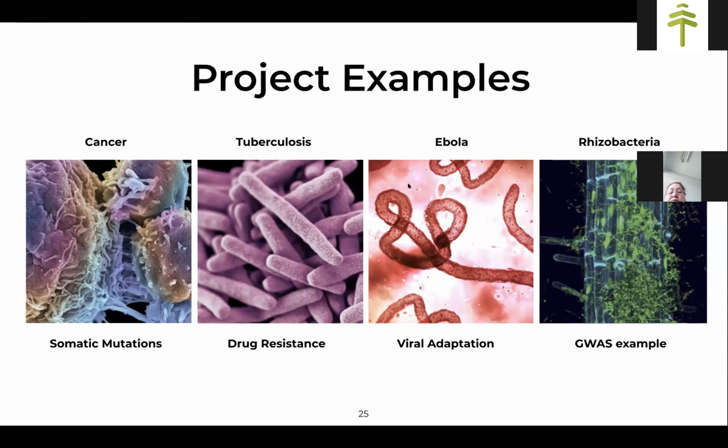We'll look at Ebola, as the epidemic that happened between 2014 and 2016 gave us an insight into the way, because of next generation sequencing, we were able to, first of all, understand the variety of genomes that we all call Ebola virus as a whole, but in reality, these are substrains, and how we can categorize that information to understand maybe which mutational profile contributed to virulence, contributed to pathogenesis, and also maybe the severity of the outcome. We will also use that information to try and apply that to our data sets where we can find, for example, a different landscape of mutational profiles in the new outbreak that is going on right now, or some other outbreaks that have happened in the past.